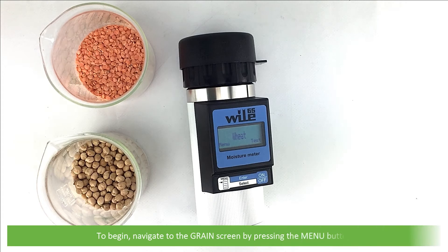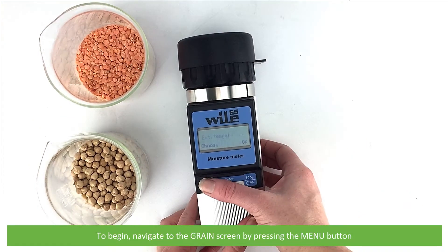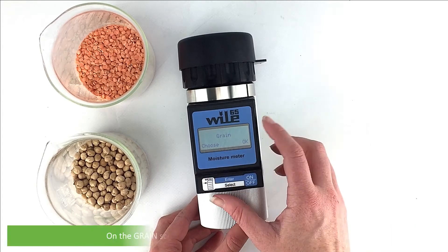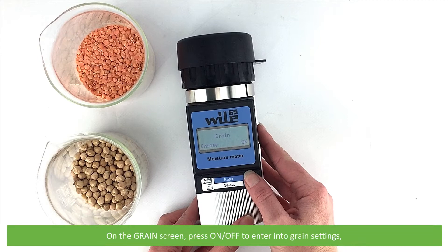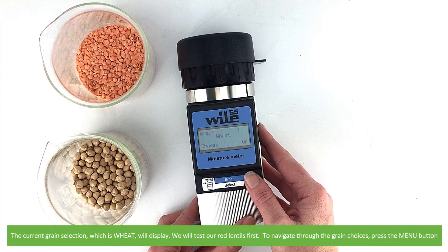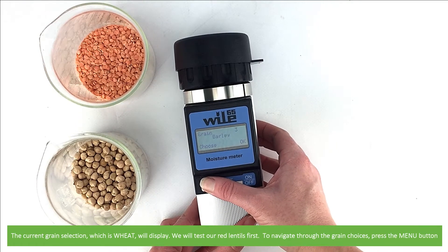To begin, navigate to the grain screen by pressing the menu button. On the grain screen, press on/off to enter into the grain settings. The current grain selection, which is wheat, will display. We will test our red lentils first. To navigate through the grain choices, press the menu button.